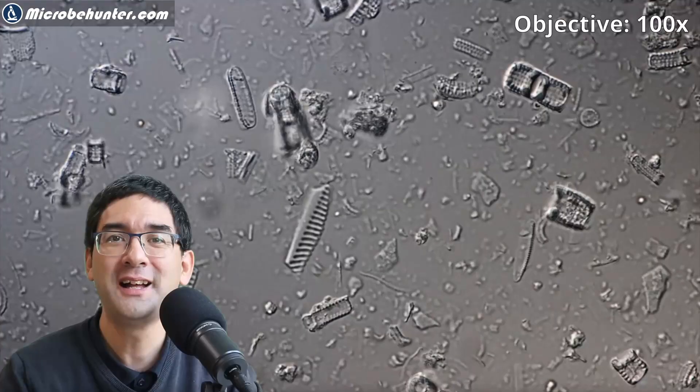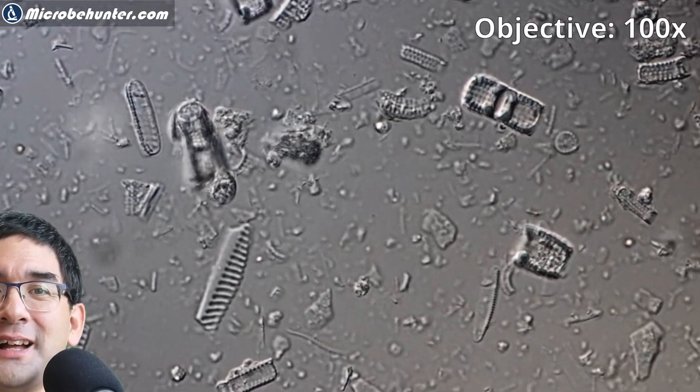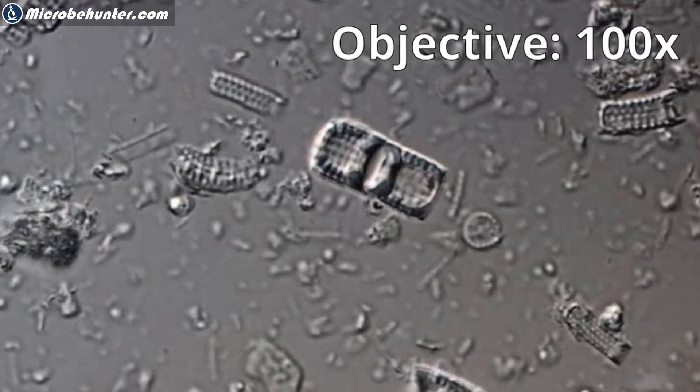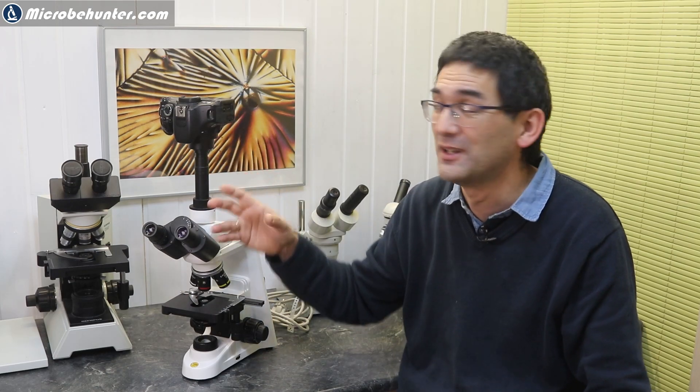Now many of my viewers in my main MicrobeHunter channel requested that I please include the magnification in the corner of my videos because they would like to know which objective they should use to get a similar image. I'm always very hesitant of doing that because a magnification value really does not mean anything, and sometimes I'm zooming in more for the specimen to fill the image. So it is really quite meaningless. What I have done now is I've included simply the objective that I've been using to get a certain image. But this does not mean that another user will get the same image with the same objective because they have a different camera system, sensor size, resolution, and so on.